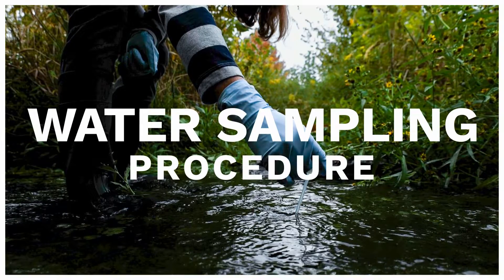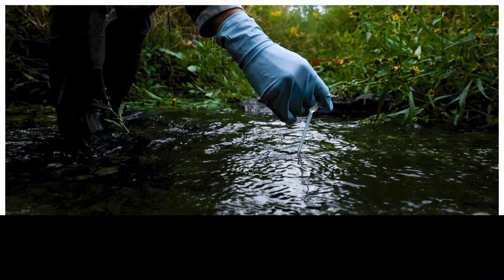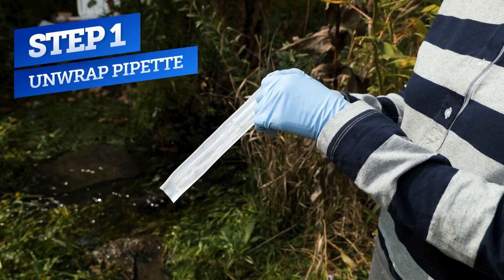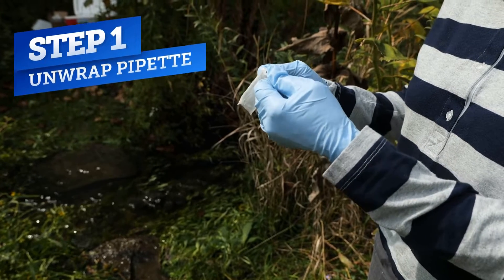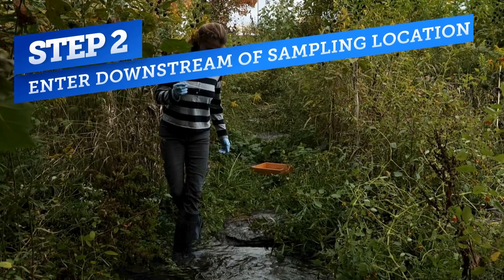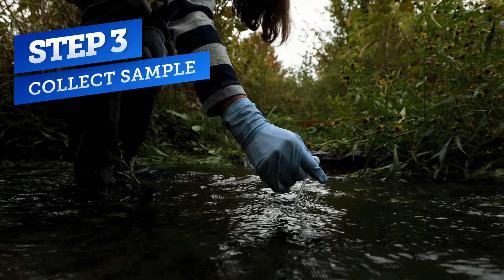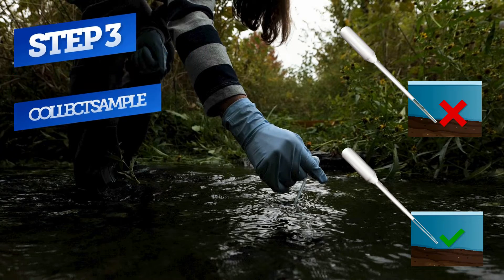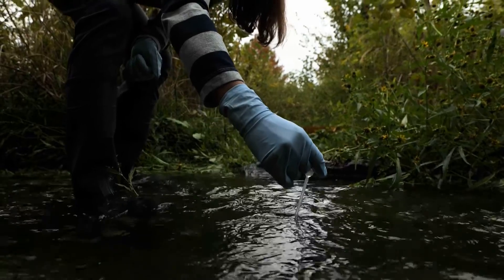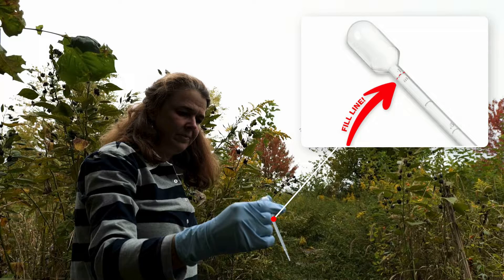In this section of the video, we'll provide a tutorial for sample collection and inoculation. Before we begin, put on gloves and place our R-cards on a flat, level surface. For the first step, carefully unwrap a sterile pipette from the bulb end. Do not touch the tip of the pipette and never use a pipette that's been previously unwrapped. Next, enter downstream of your sampling location to avoid suspending sediment within the sample collection area. Squeeze the pipette bulb and insert the tip two or three inches below the water surface, being careful not to touch the stream bed, then slowly release the bulb to draw water into the pipette. Expel excess water until you reach the desired one milliliter sample volume, indicated by a small raised line near the bulb.